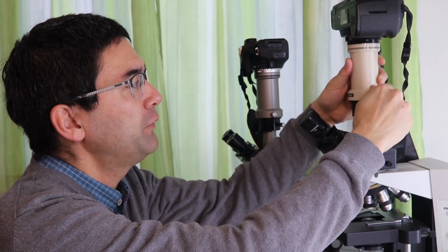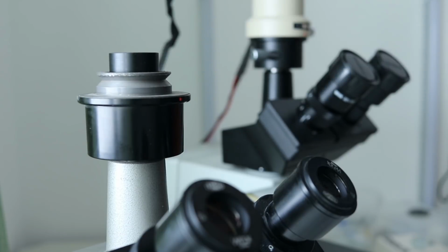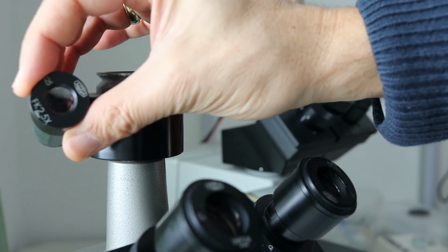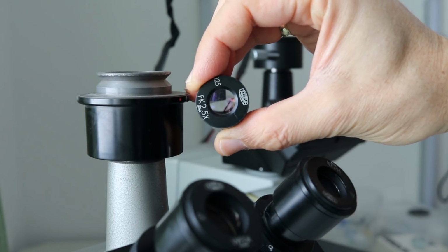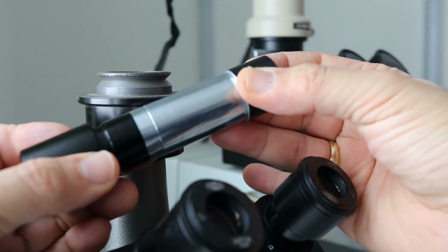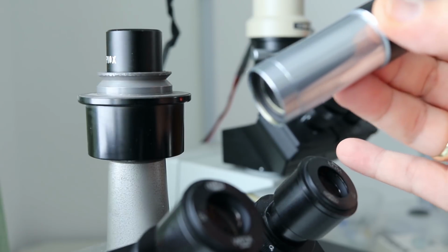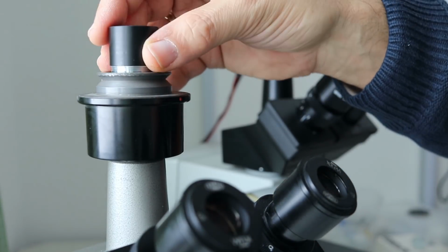And I'm just going to take the top part off here to show you what they are. What you can see is that there is a photo projection eyepiece, a photo projection ocular, in there, which is responsible for taking the image of the objective and projecting it into the camera. Theoretically you could also use a normal eyepiece for doing the photo projection. Some people actually do. However, the image quality is a little bit lower, because those photo projection oculars correct lens errors of the objective and a whole bunch of fancy other things, which normal eyepieces don't do. But in principle, you could exchange this and it would also work.